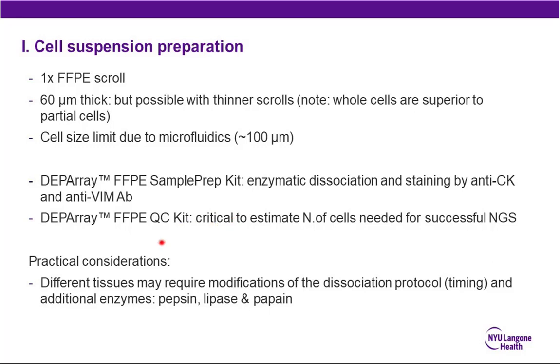For practical consideration, keep in mind that this is sort of a one-size-fits-all kit, but different tissues may require slightly different sample preparations, dissociation protocols and timing, and you may want to experiment with different enzymes such as pepsin, lipase, or papain.